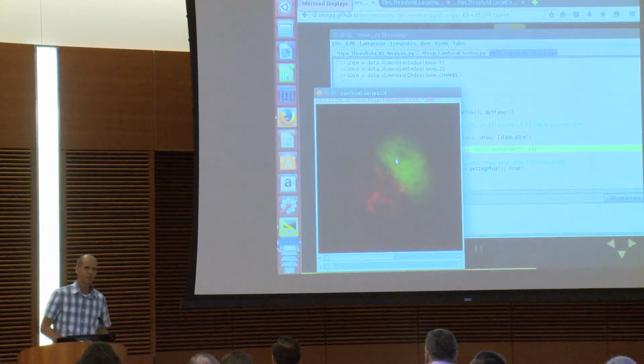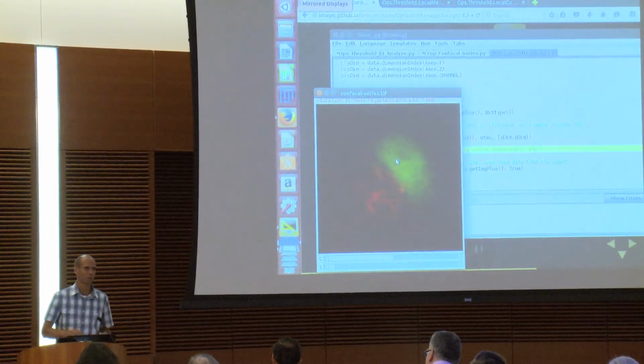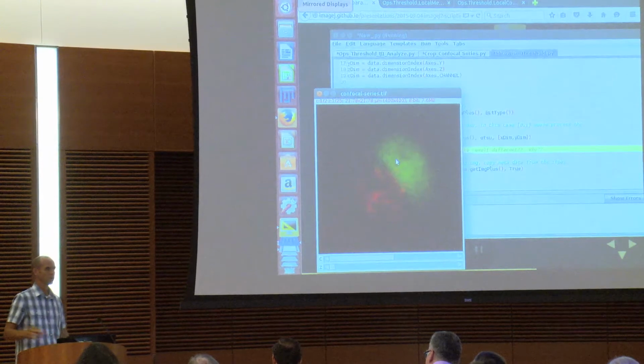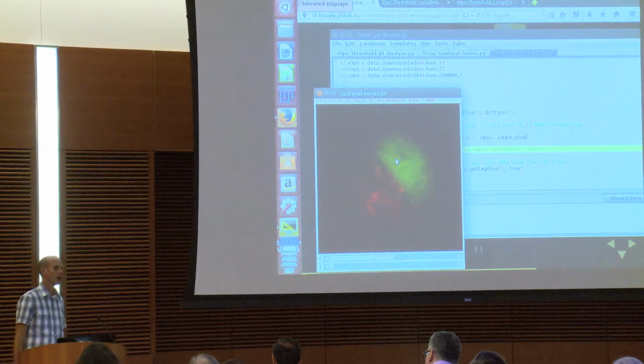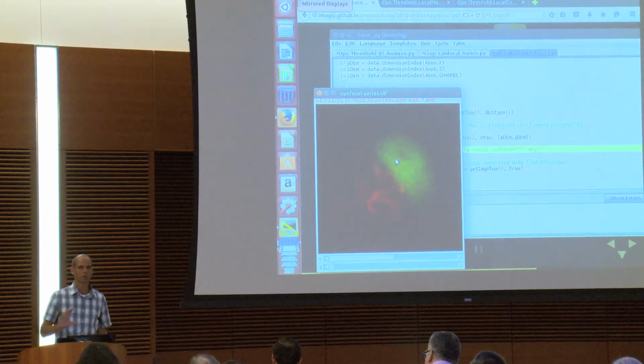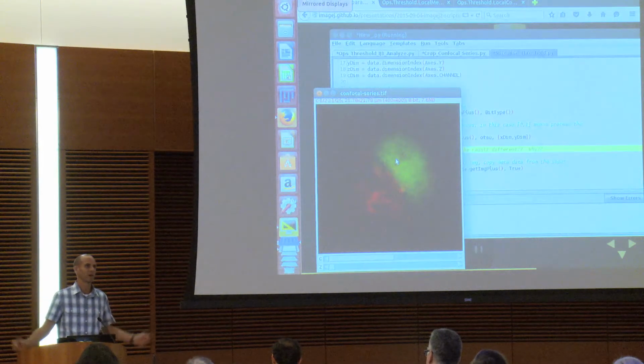Again, it took me a long time to grasp all these concepts and get more comfortable with the APIs. All these examples are in two places: they're in the tutorials and they're embedded into the presentation. So if you want to go back and look at them after, and ping all kinds of questions, that's the way to do it. I wouldn't be able to absorb it in 2 hours.